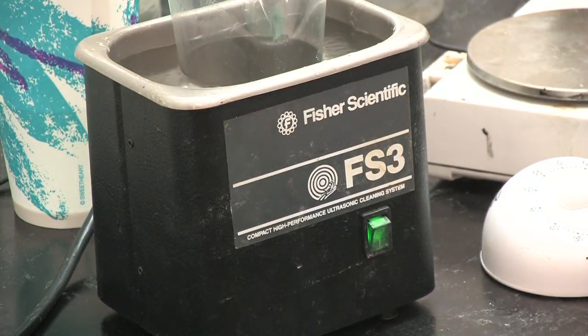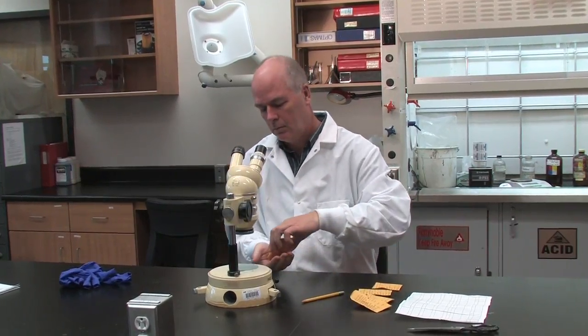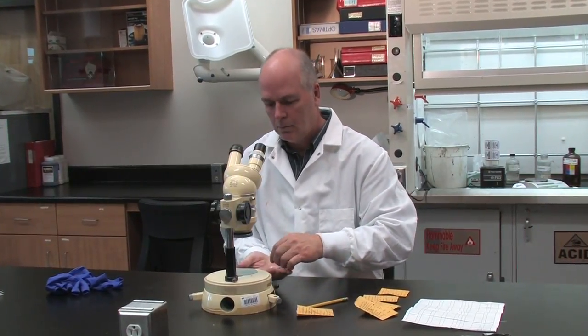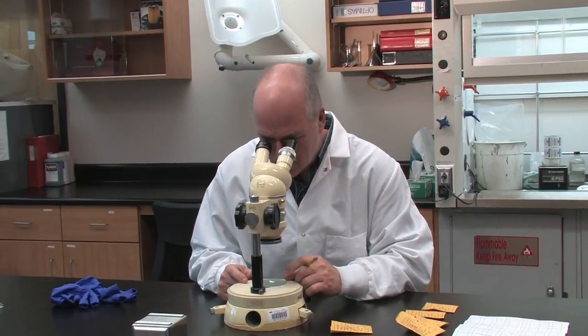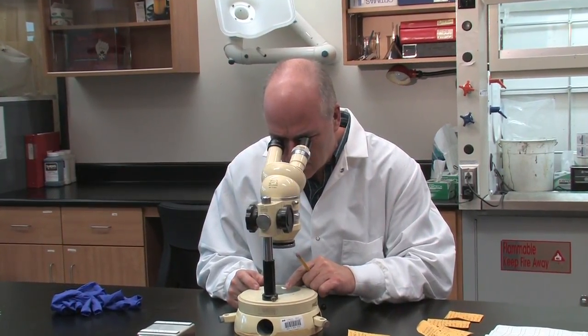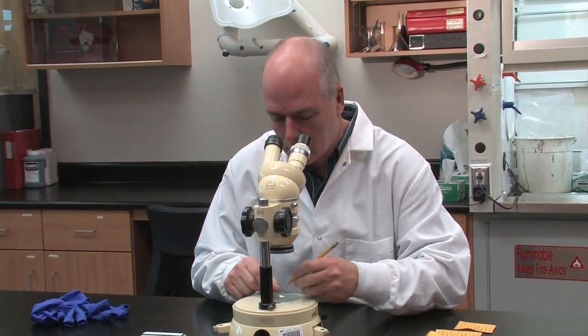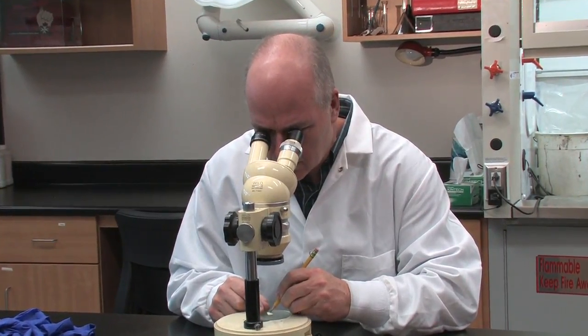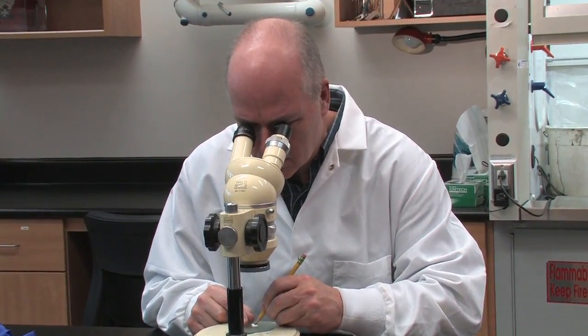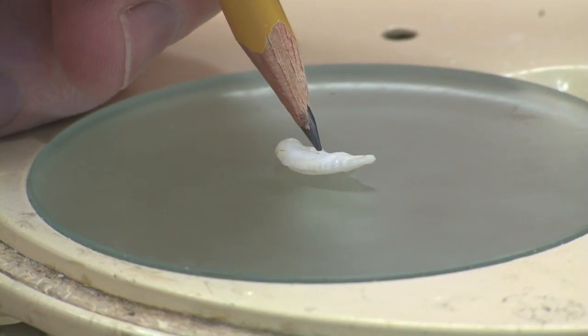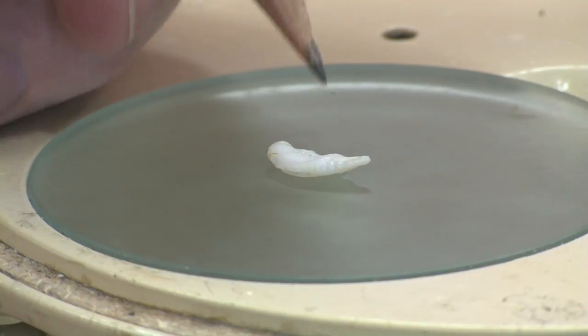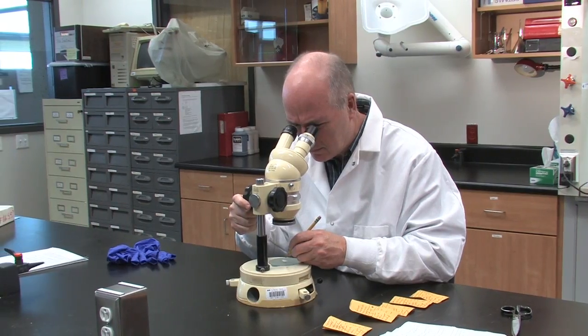While the epoxy is sonicating, you can remove the otoliths from their envelopes and mark the cores. Marking the cores makes it easier to see where to line up the cup when sectioning the samples. In this example, we're embedding redfish. Use a pencil, not a pen, to mark the cores. The marking can be done under a dissection scope as seen in previous videos.